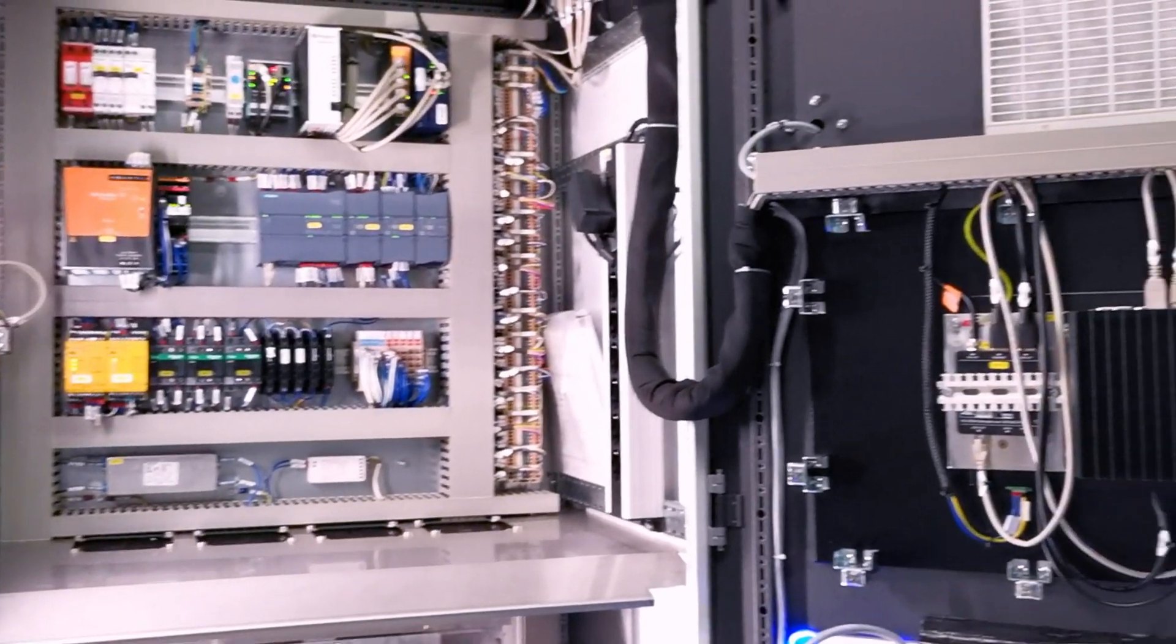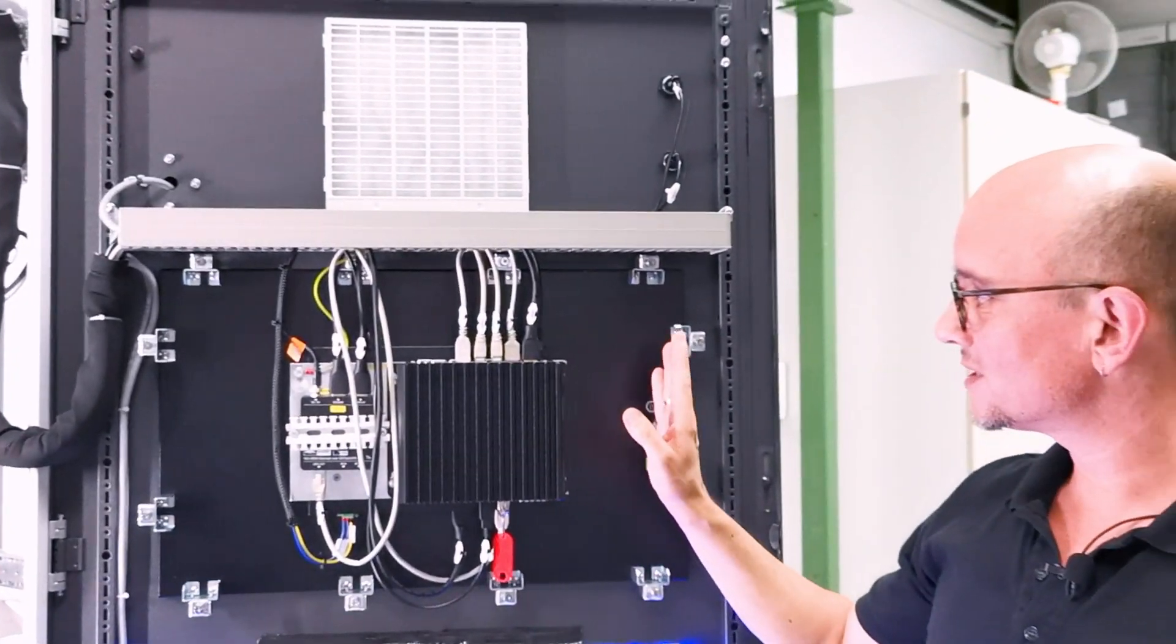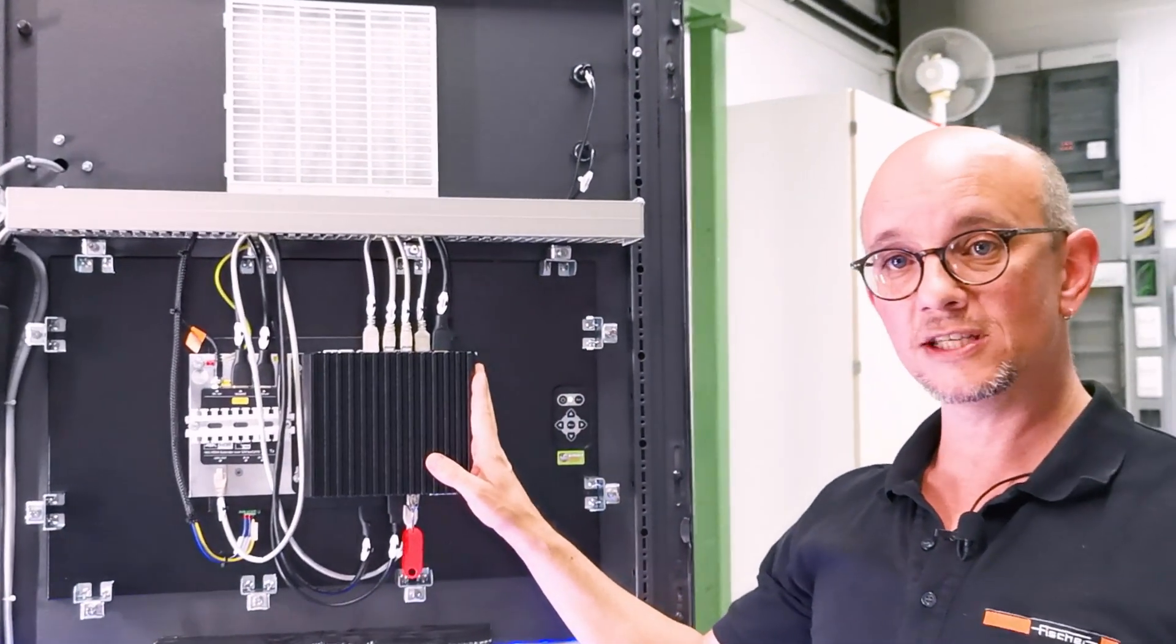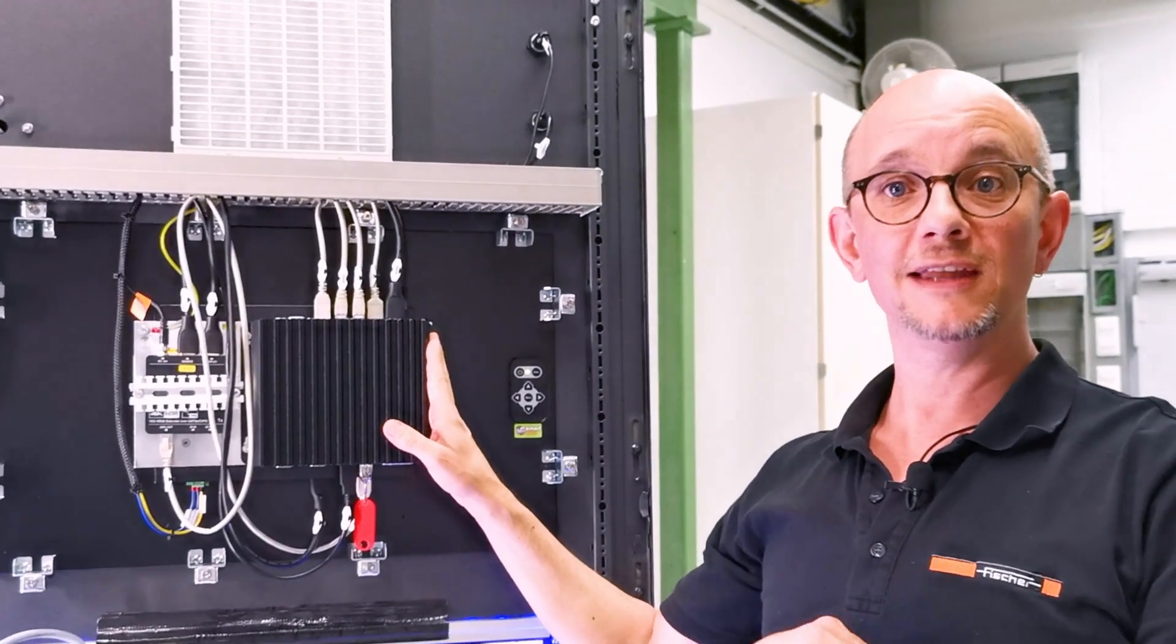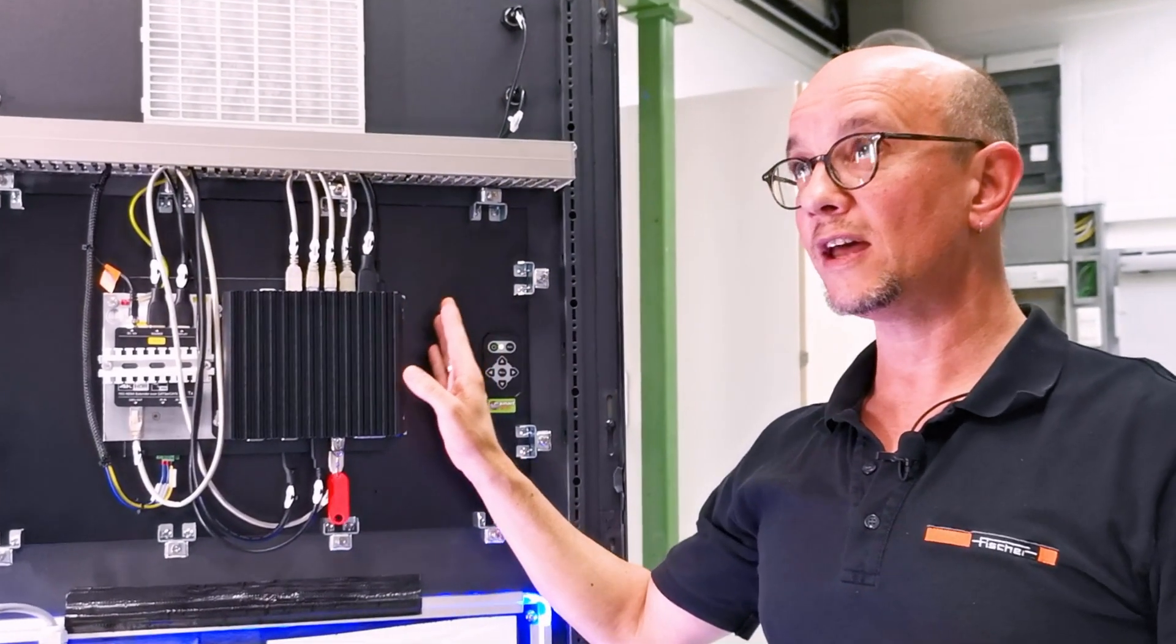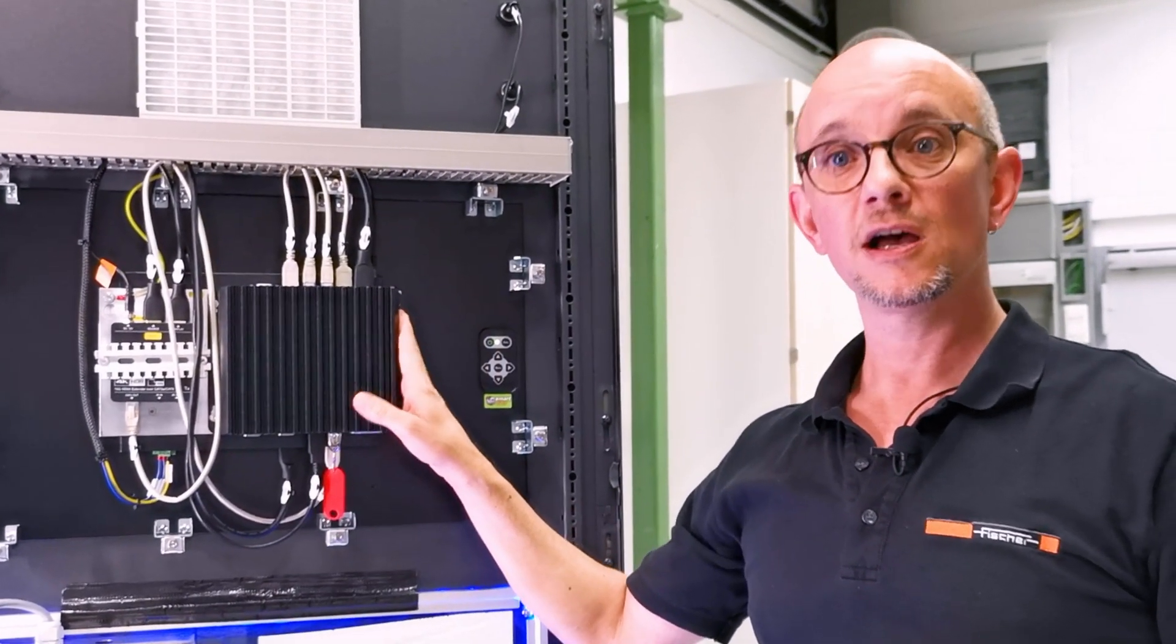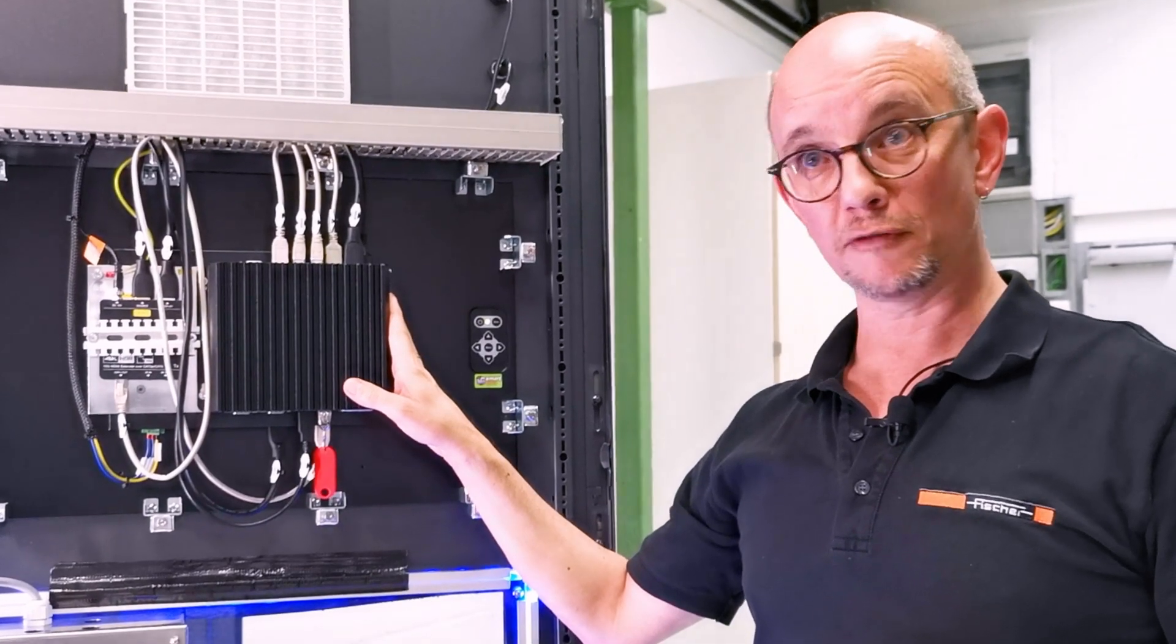Here on the back side of the door, we see the panel PC running Windows 10 IoT and the WinFTM 6, our well-known XRF software.